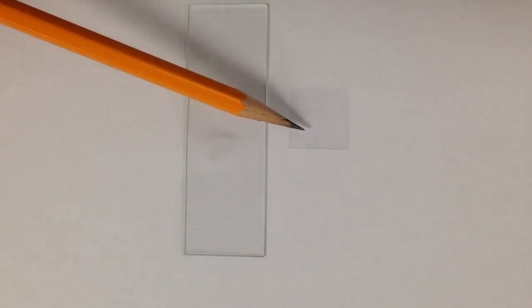So in order to make a wet mount slide, you need to start off with two things. First, you need your glass slide, which is the long rectangular piece, and you need your cover slip, which is the plastic square.